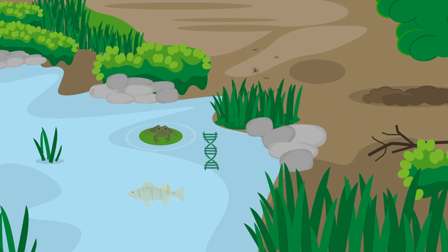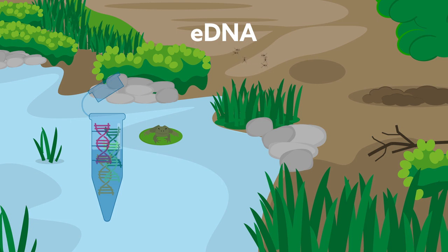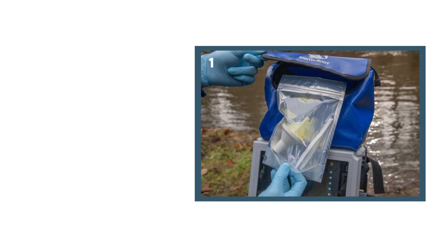Environmental DNA capture is helping researchers to do the seemingly impossible: track the numerous plants and animals that call natural waters home. But fishing for so-called eDNA can be precarious work. Each step of the process, from water sampling to DNA detection, is a point of entry for contaminants or of loss for sample material. Now, a new standard could be in the making.